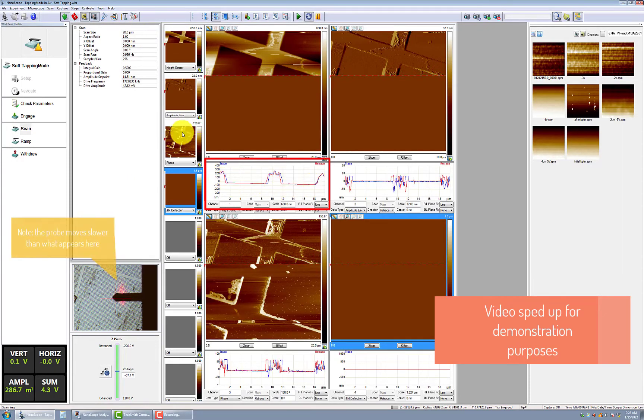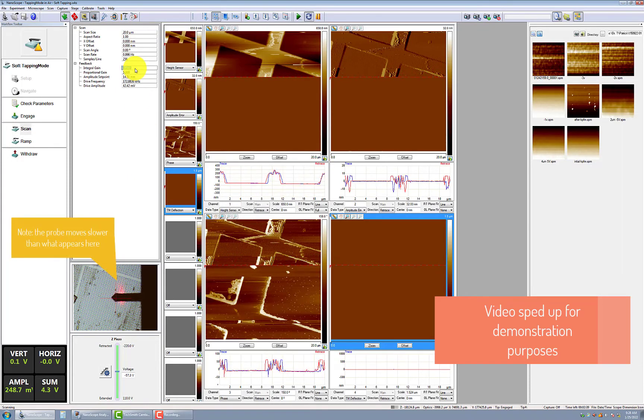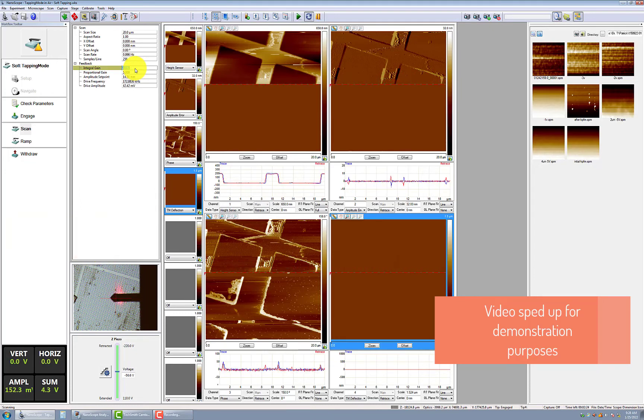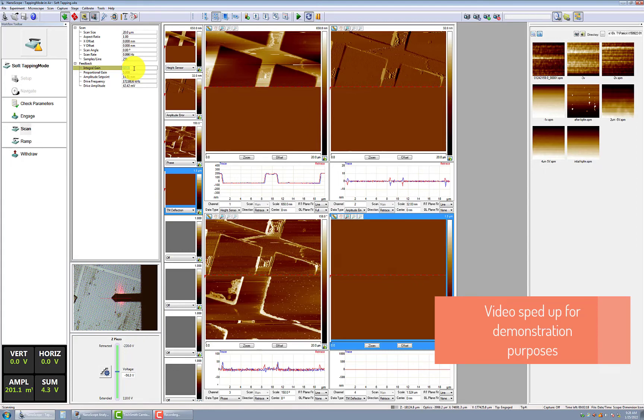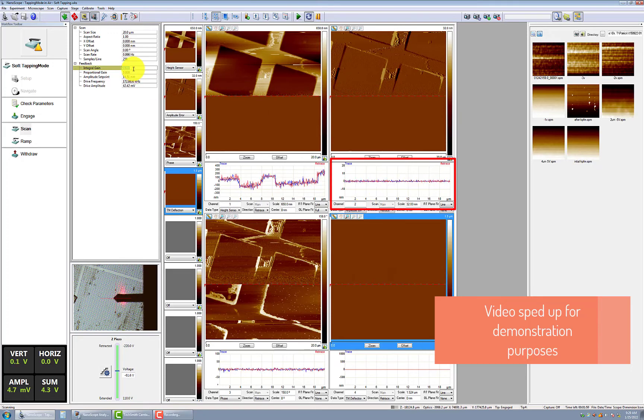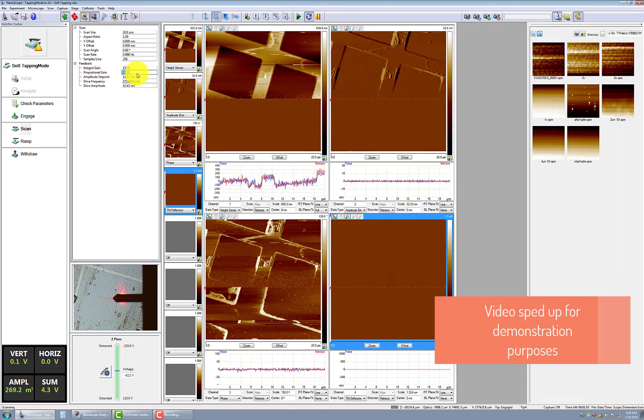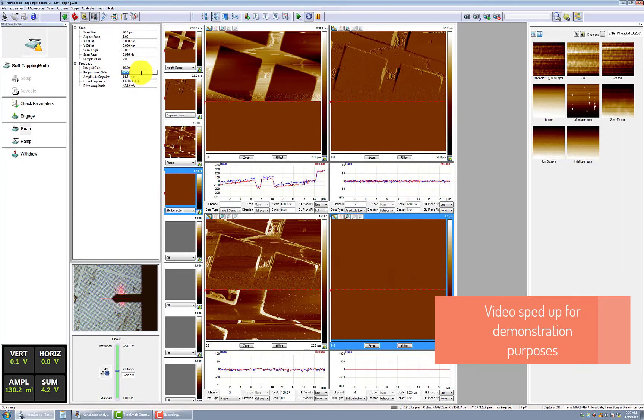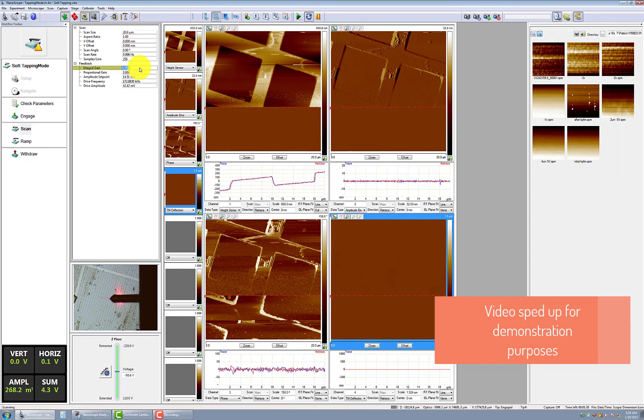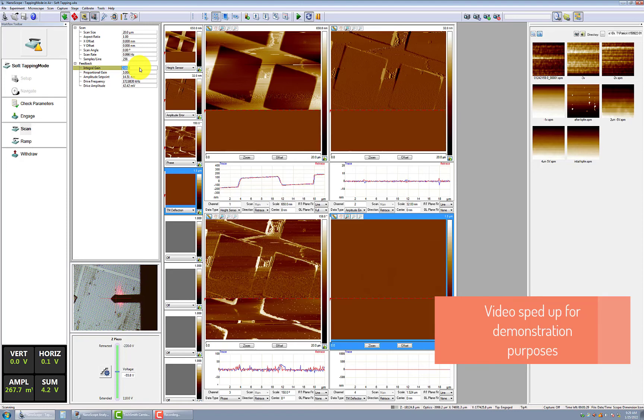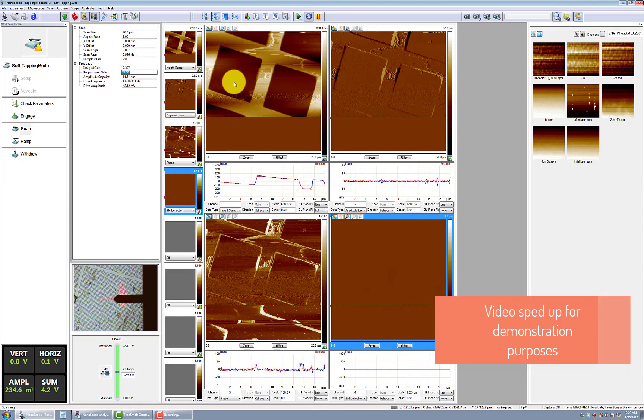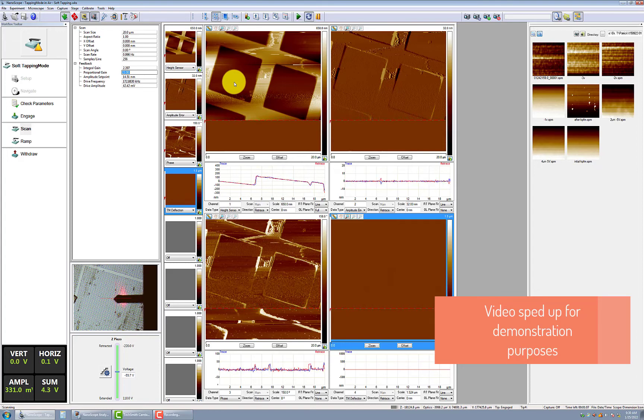To adjust, gradually increase the integral gain by clicking the right arrow key. By improving the tracking between the trace and retrace, you should also see a reduction in the amplitude error. To find the optimal integral gain setting, continue to increase the integral gain until there is obvious noise in the amplitude error signal, then decrease the integral gain by approximately 20%. Once the appropriate integral gain setting is reached, adjust the proportional gain to 10 times the integral gain.